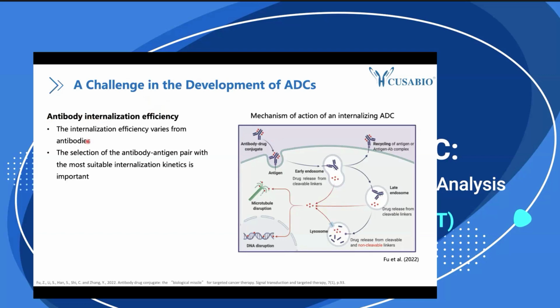Internalization efficiency is really important because different antibodies can have different efficiencies. This means you probably need to assess the internalization efficiency if you want to choose an optimal antibody, and choosing a good pair between the antibody and antigen will make sure your internalization is ADC compatible.